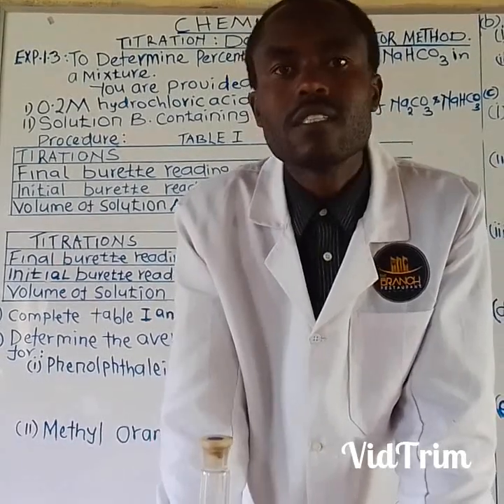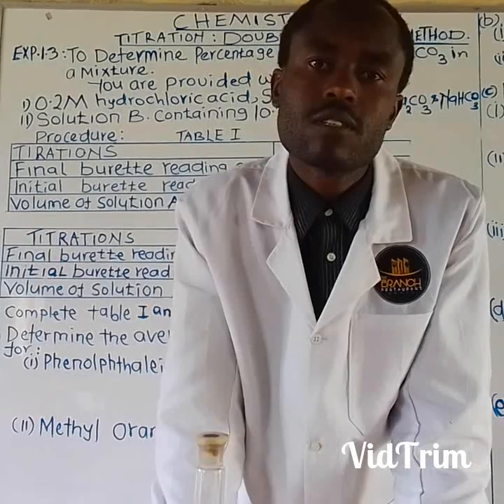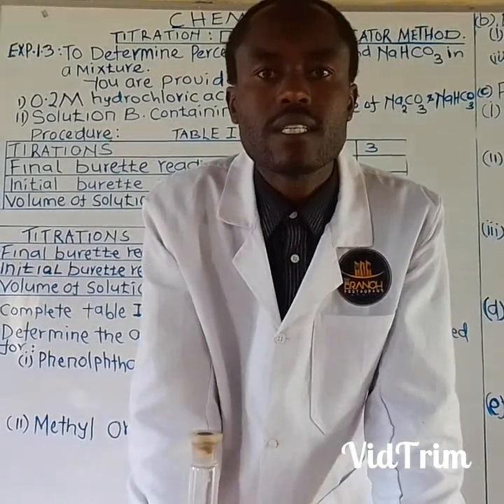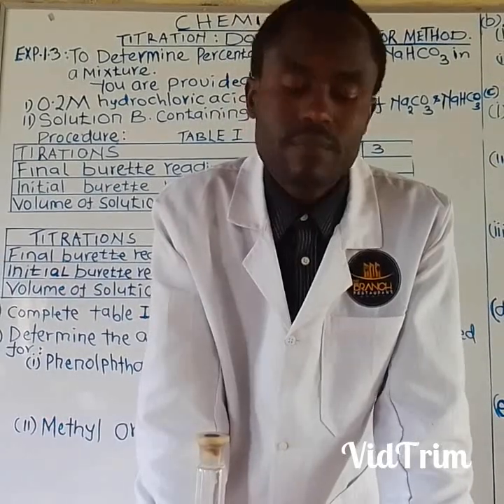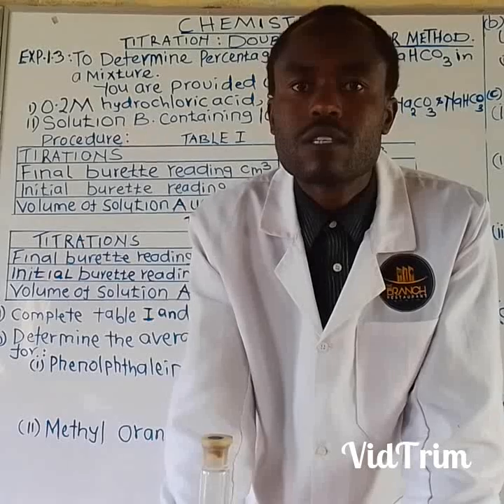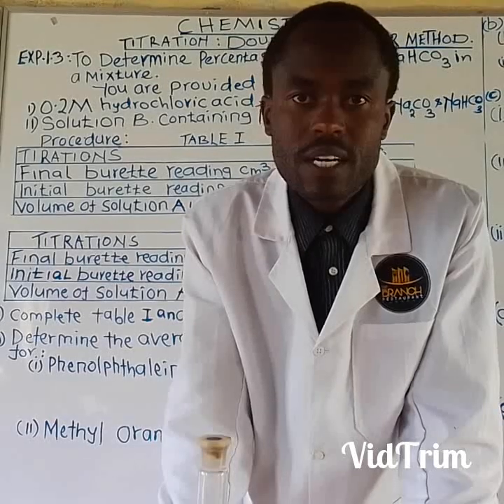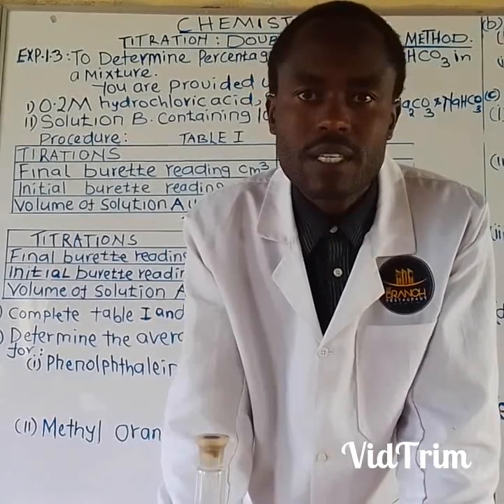And in today's lesson, we are going to discuss titration, but specifically the double indicator method. Is it okay? So welcome. It's a very interesting lesson. It will take about 40 minutes. But before I continue, I have to show you the chemical reagents that I have with me here.